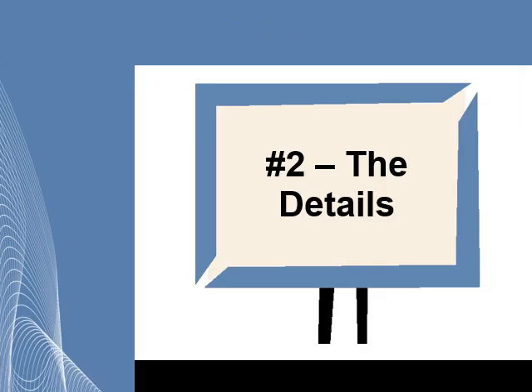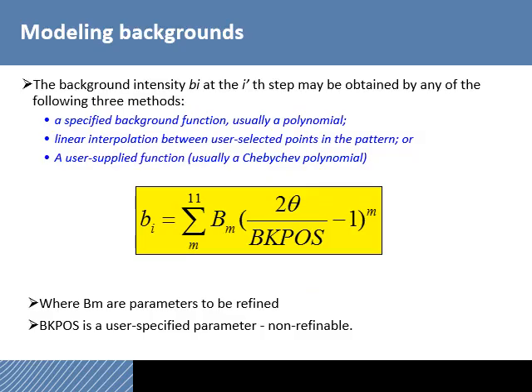All right, so now we're going to show some of the details. This is the part that has all the math in it. I'll go through it pretty quickly. Again, you're not responsible for the math. I just want you to understand that these are all things that you can refine as part of a Rietveld refinement. You don't have to refine all these. You make decisions about what to refine and what not to refine.